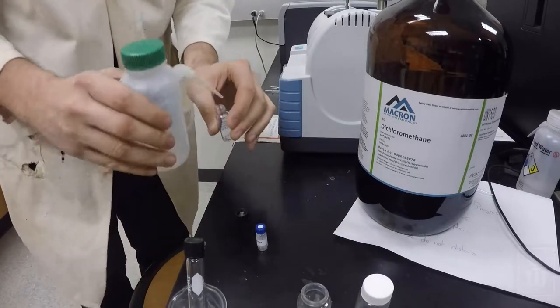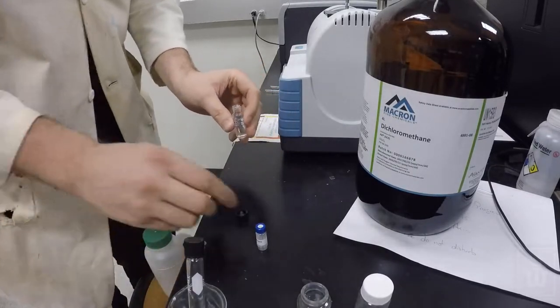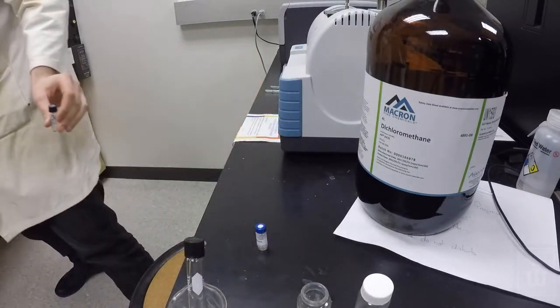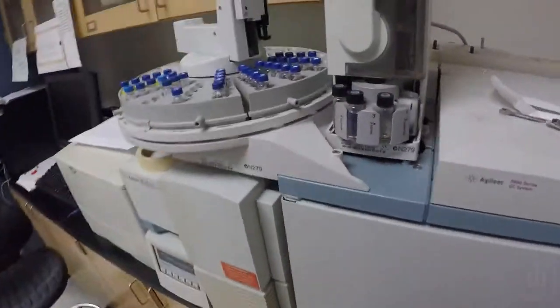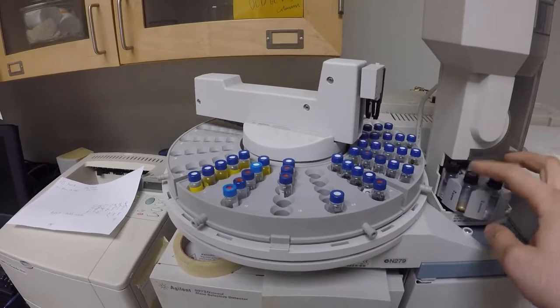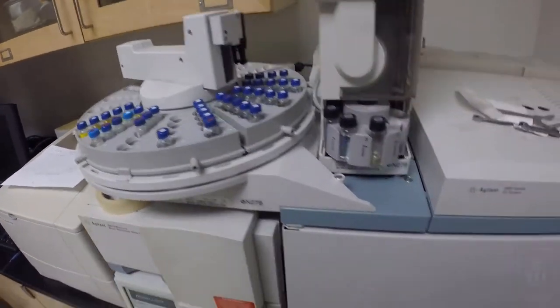The idea here is that we want a polar and a non-polar solvent so that we can clean out anything that gets gunked into the syringe, any of our sample that's left over, it will get dissolved. So now I have methanol in there, and I'm going to move that into solvent B here in the turret, okay? So we have both of our solvents in here. We have two waste containers. If those aren't looking full, you can just leave them, no biggie.